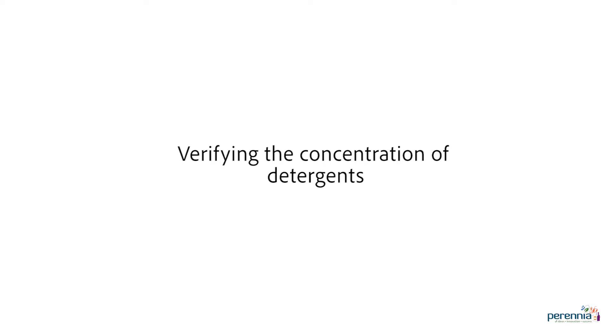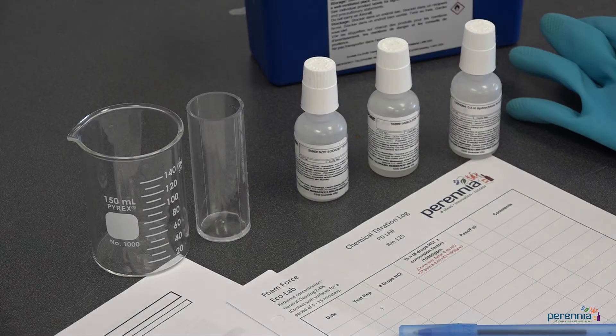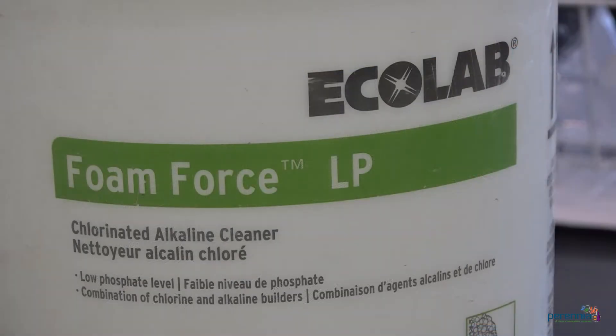To ensure you're using the correct concentration of detergent for your sanitation procedures, you can verify the concentration by performing a titration. For today's demonstration we will use Ecolab's Foam Force, a chlorinated alkaline detergent used for cleaning stainless steel equipment and environmental surfaces within a production facility to remove protein, fat and carbohydrate soils. To effectively remove these soils the foam must have a contact time of 5 to 15 minutes and the concentration when mixed with water must be between 2 to 4 percent. Less than 2 percent we may not be removing all of the soils, and greater than 4 percent we may be leaving behind chemical after the final rinse or we may be wasting chemical.